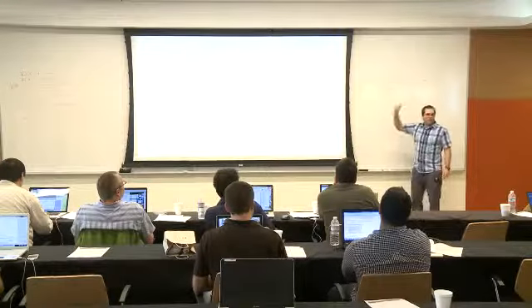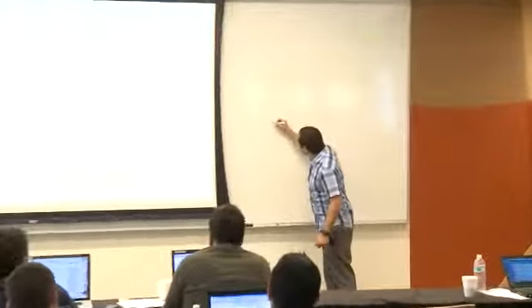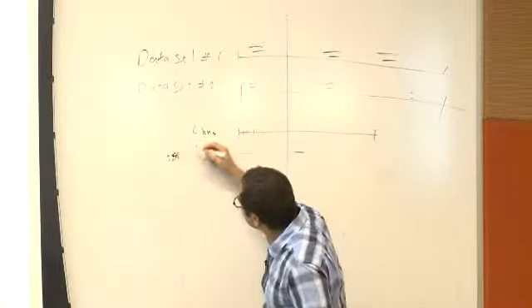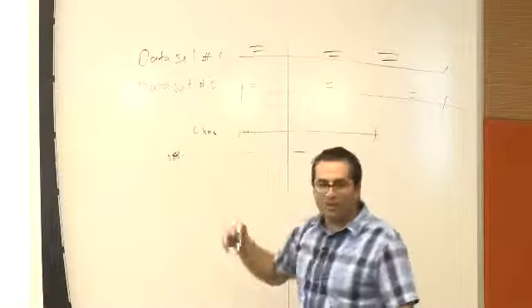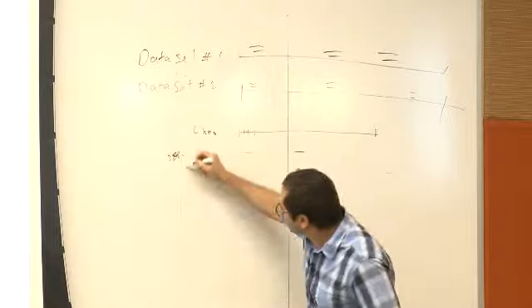Taking these BAM files, we are then going to generate what we call bin files, which are kind of vectors, where for the beginning, it's going to be for each 25 base pairs, we're going to have a score of how many reads are falling on these 25 base pairs. So we're going to have numbers.